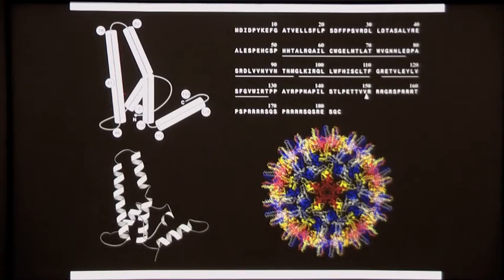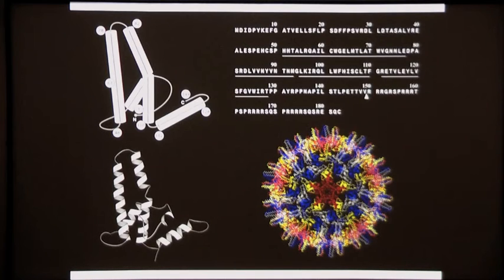And we managed to do a complete chain trace, assign the sequence here. We actually numbered the chain trace. And when Sam Wynne and Andrew Leslie solved the crystal structure of the same thing a couple of years later, fortunately we found we'd got it right. So this was the first single particle structure where a protein had been solved in terms of a correct numbered chain trace. So that's another kind of landmark in 1997.